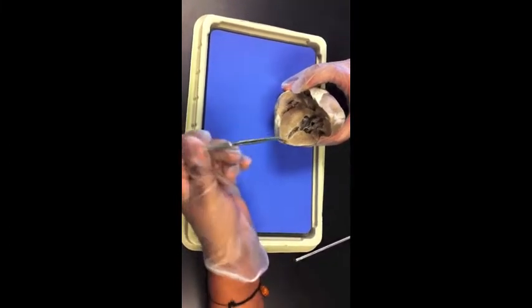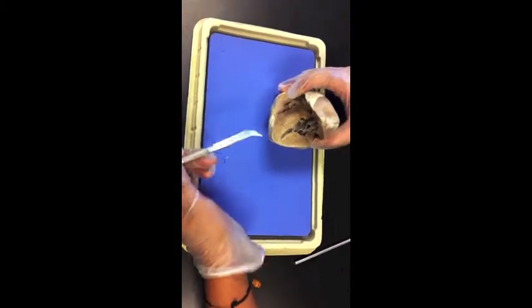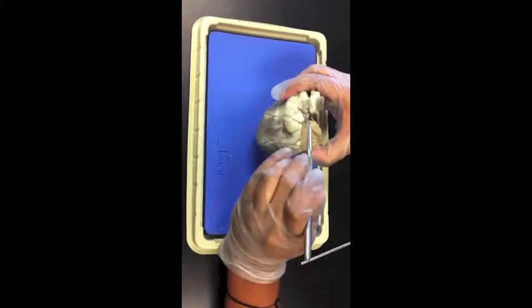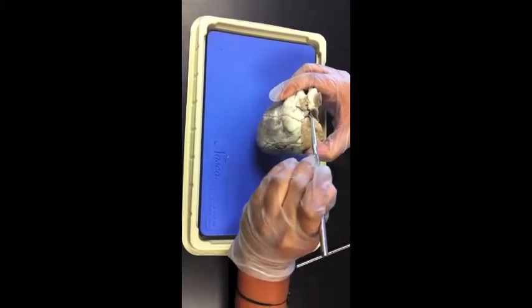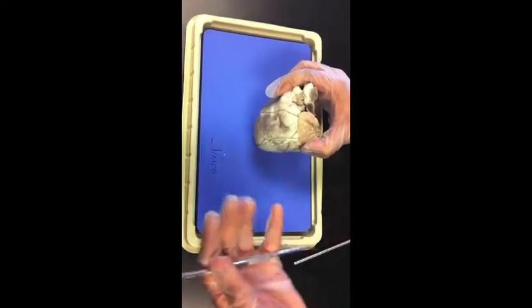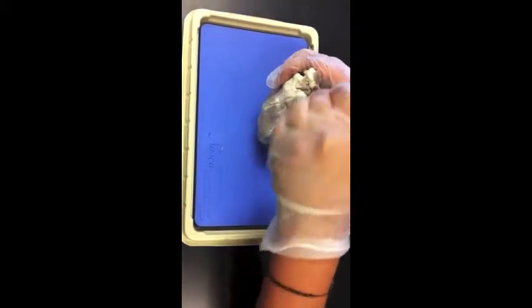We also have semilunar valves, which are the pulmonary valve and aortic valves. And so the pulmonary valve is at the opening where the pulmonary trunk leaves the right ventricle. So over here is your pulmonary trunk. That's the opening. This is the pulmonary trunk. You would normally see a pulmonary artery. However, the artery was cut off when the heart was being cut out of the sheep. So you don't see a pulmonary artery here, but this is the pulmonary trunk.